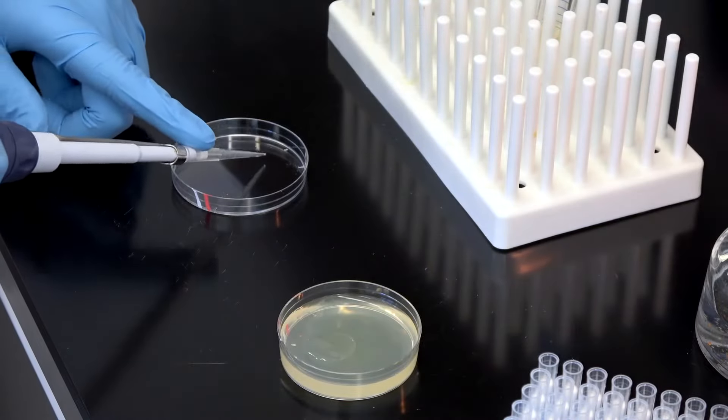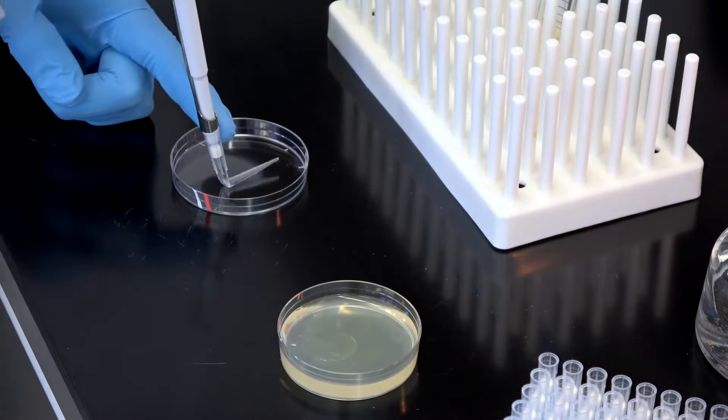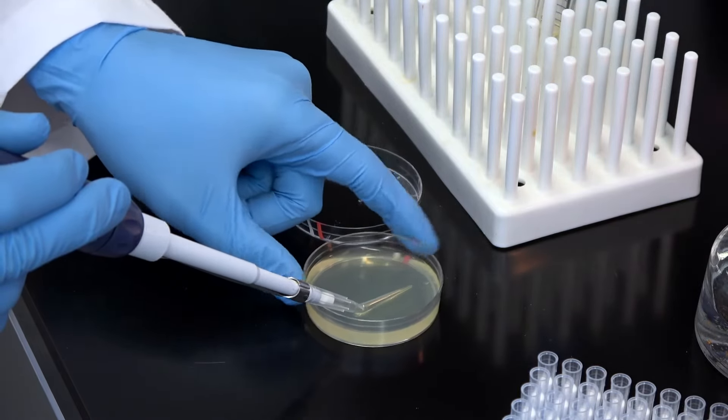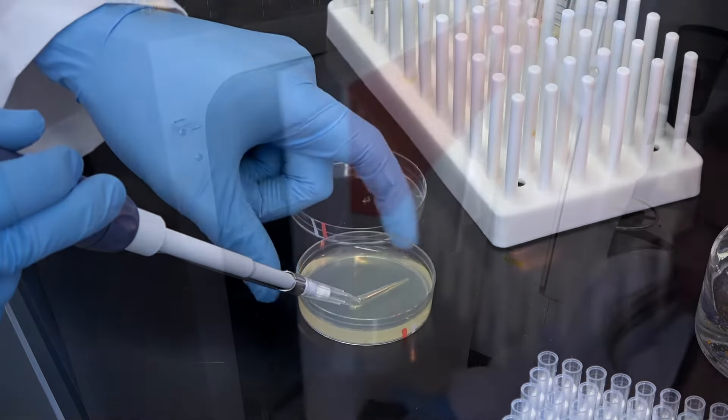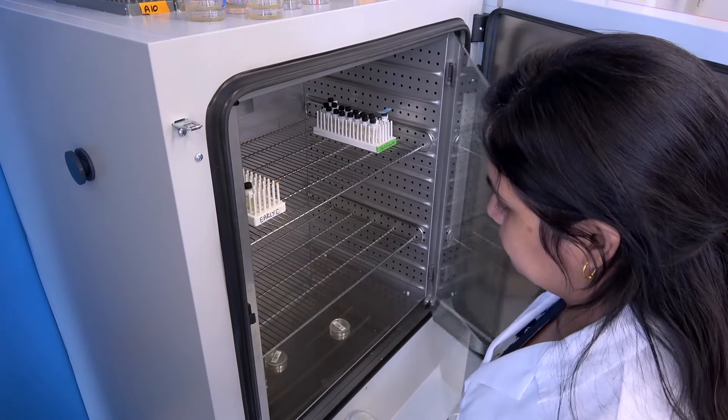If you use pipette tips that are easy to bend, like ours, you can also use them as spreaders when plating the cells. Be careful when bending the tip and make sure you are using good sterile technique throughout the process. The last step is to place the agar plate into an incubator for overnight growth.